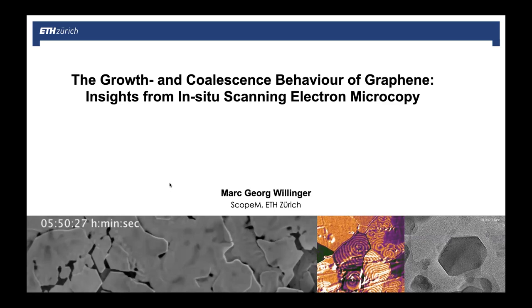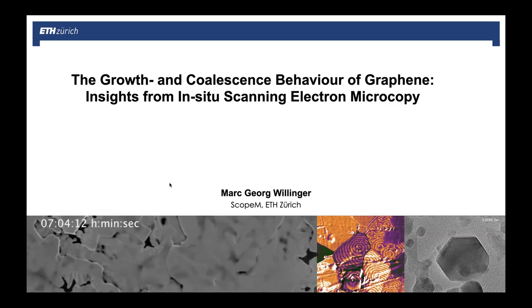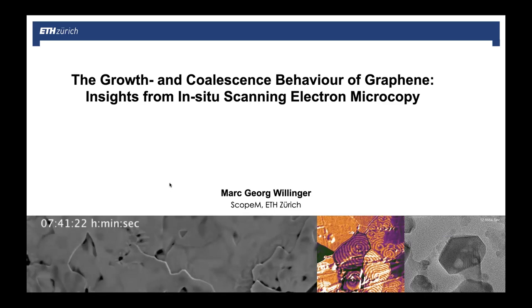This presentation is about in situ observation of graphene growth. So I'm a very visual person. We do lots of spectroscopy. We do lots of things that are a bit indirect, but I love to see things as they're happening. And so that's somehow maybe because I'm doing electron microscopy.